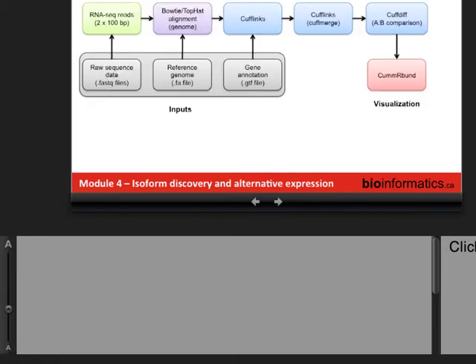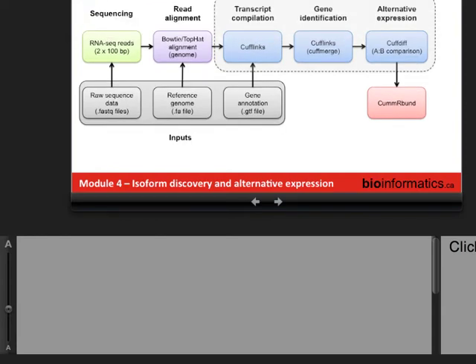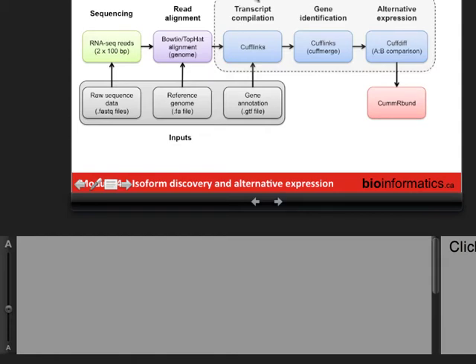We're gradually working through the flowchart of steps. Now we'll circle back to running Cufflinks but change up the options — Cufflinks has many options and can run in different modes with different goals, essentially multiple tools in one. We'll do a transcript compilation with Cufflinks, merge transcripts together and compare to known transcripts, and then use CuffDiff for differential splicing analysis or alternative expression analysis instead of just simple differential expression.